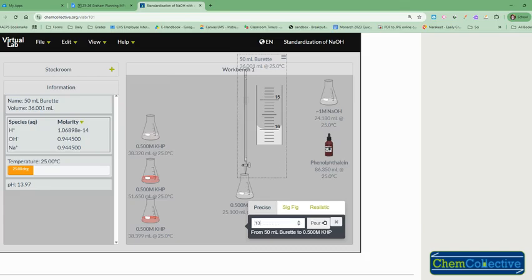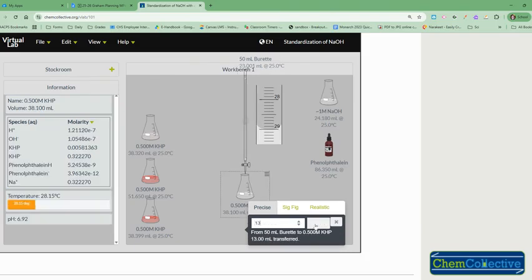I know I can do 13 really quickly, and based off of my calculations, I know that I can do 0.2, and then I'm going to switch to 0.01. Oops, 0.01. And then I'm going to pour. So 1, I think that's faint pink right there. Do one more to make sure.